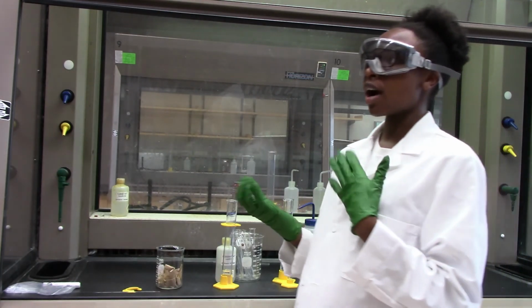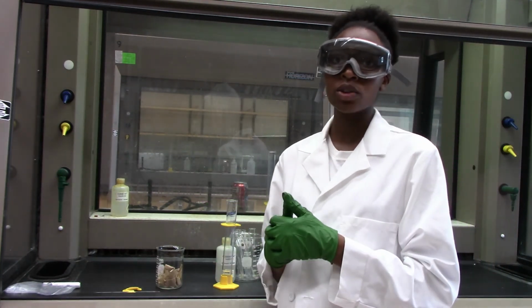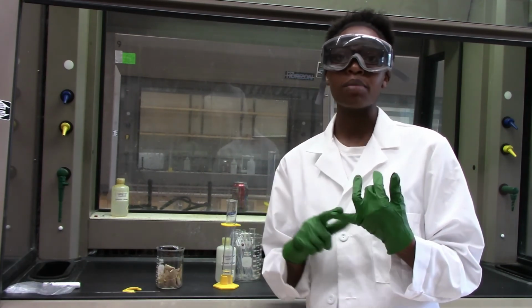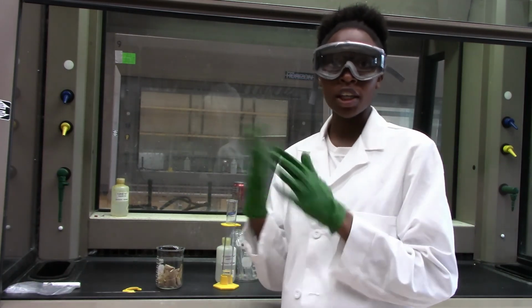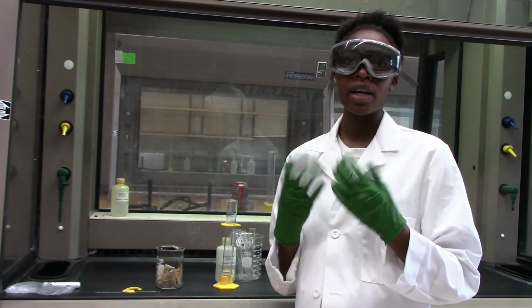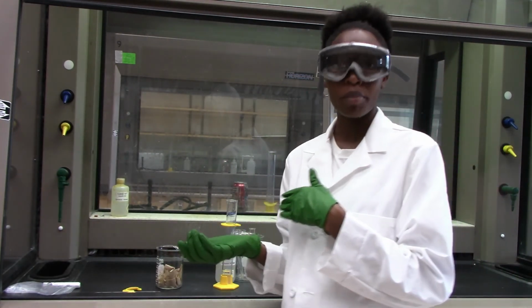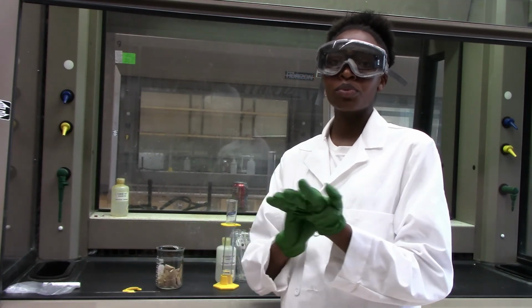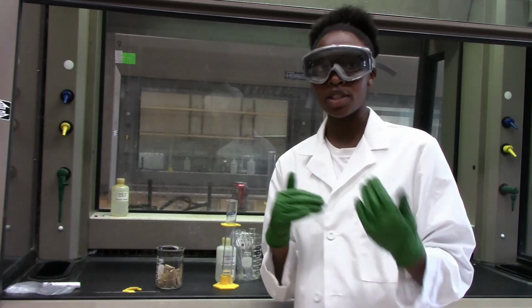And so there are 3 steps to this experiment that we are going to carry out. First, we will prepare the standard, which will make sure that equilibrium is far to the right, to make sure that the products are favored, by reacting all of the thiocyanate to form our product. We will use that to determine the equilibrium concentrations of the other species.